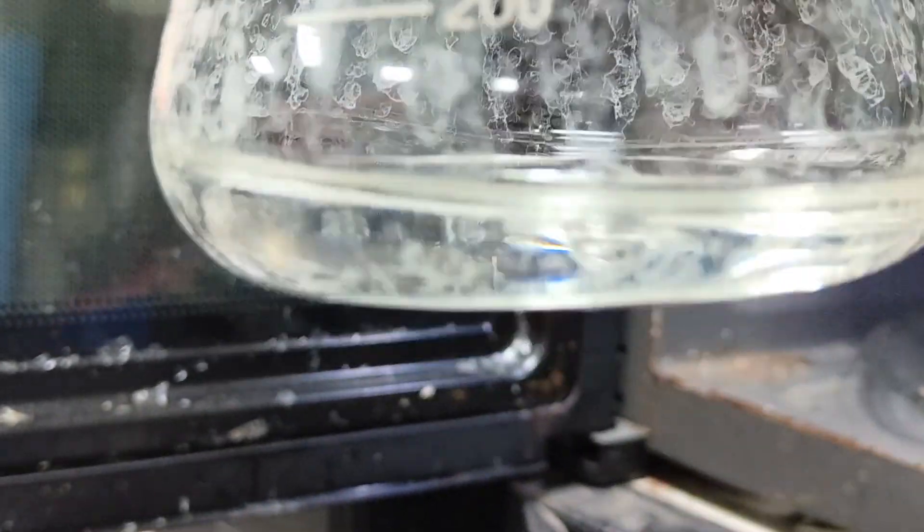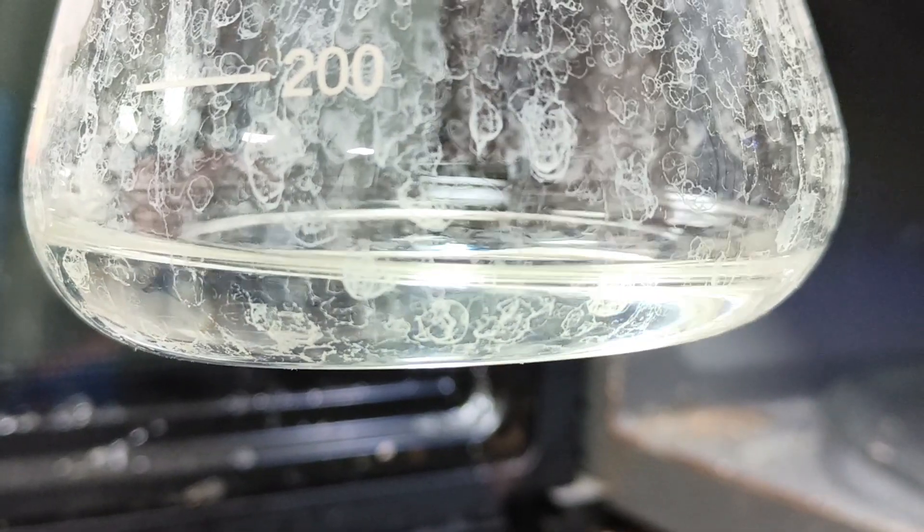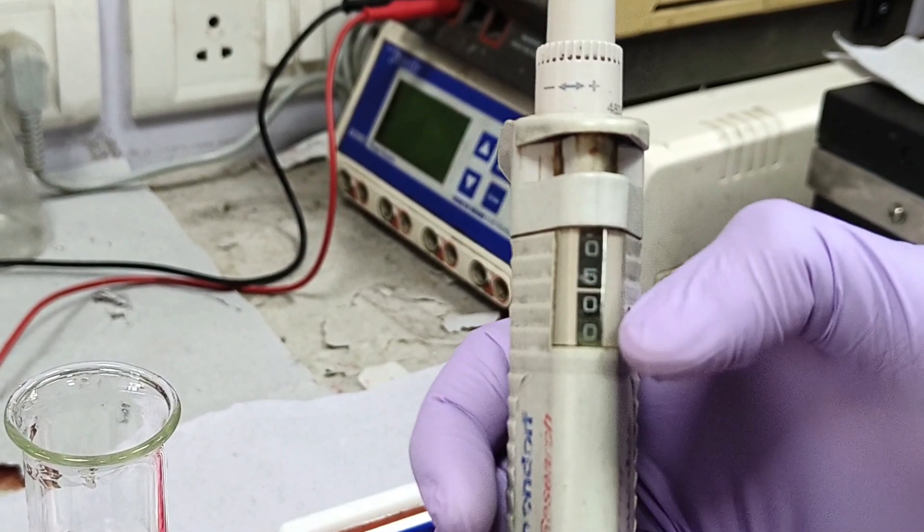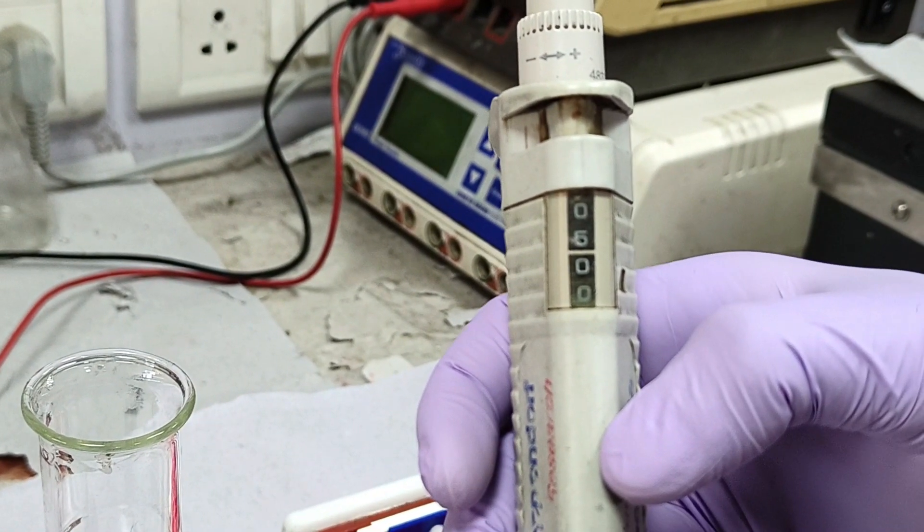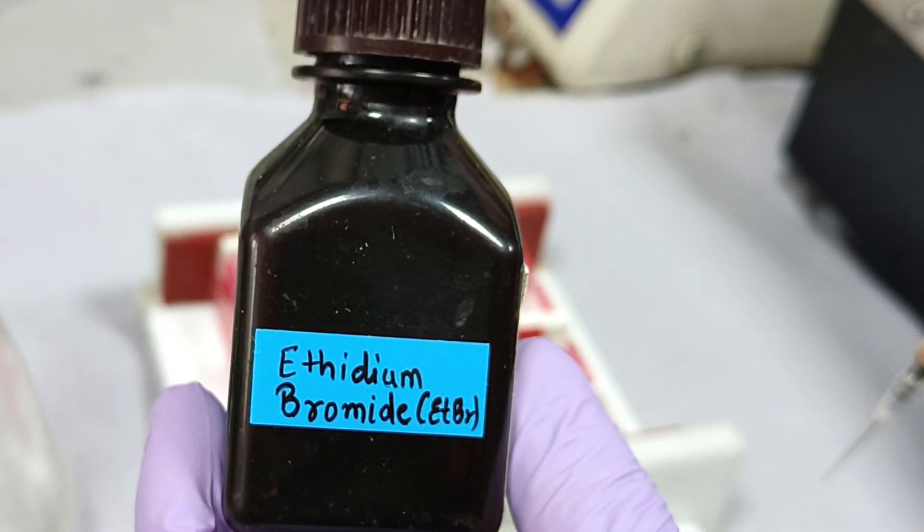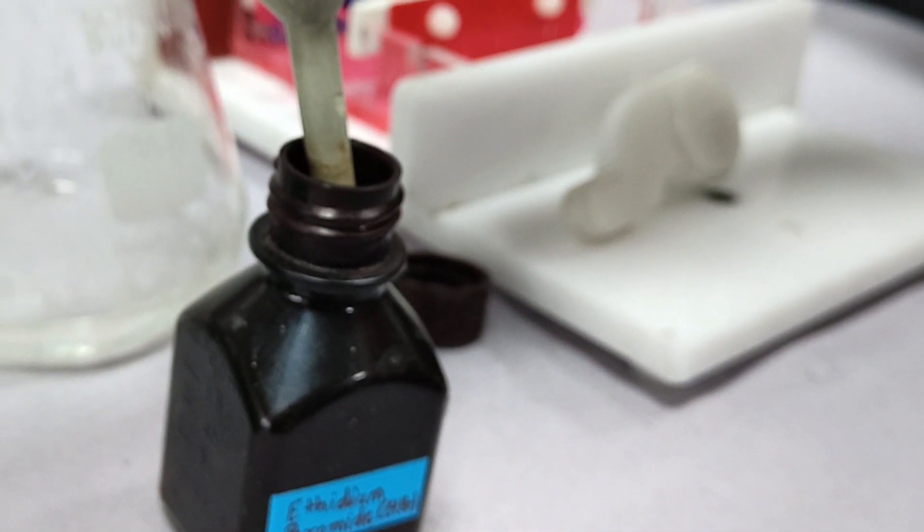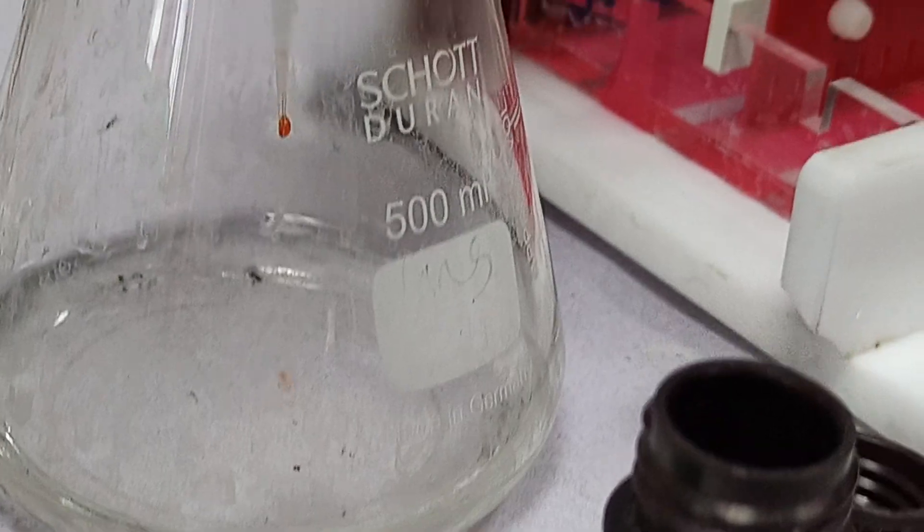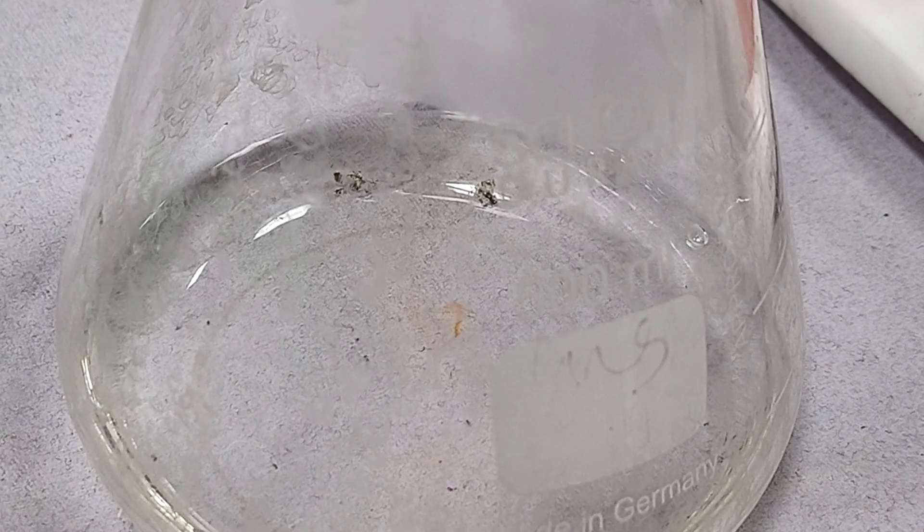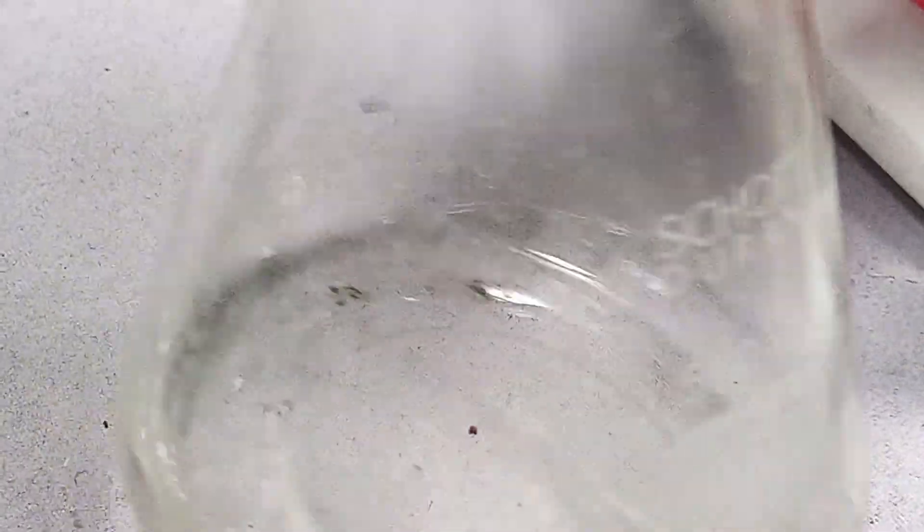Once it is boiled, ensure that the agarose is completely melted and the solution is clear. Cool down the agarose to room temperature and then add 5 microliters of EtBr. Note, it is carcinogenic in nature and should be handled carefully. Be sure not to add the EtBr when the agarose solution is hot as it is temperature sensitive chemical. Gently swirl the flask to mix the EtBr in the gel.